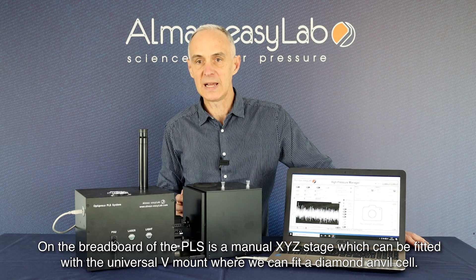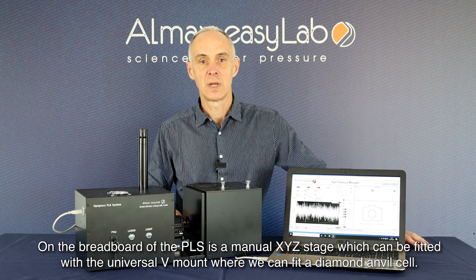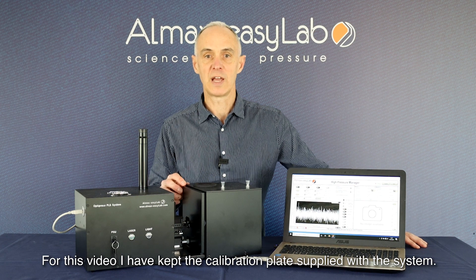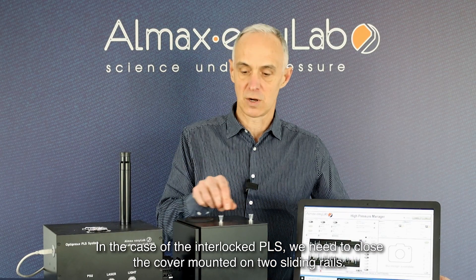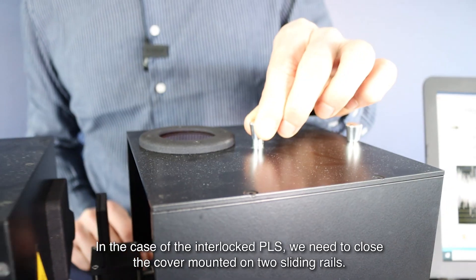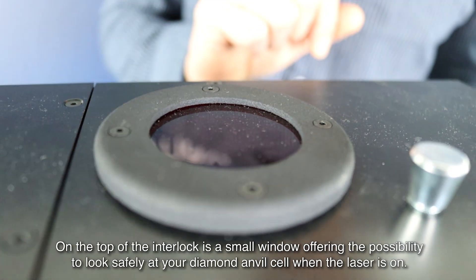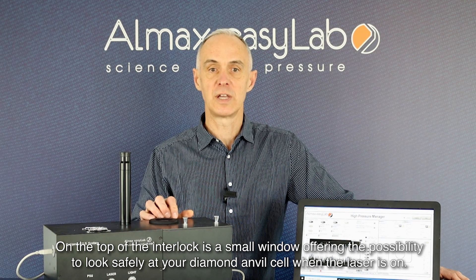On the breadboard of the PLS is a manual XYZ stage, which can be fitted with the universal V mount where we can fit the diamond anvil cell. For this video, I have kept the calibration plate supplied with the system. In the case of the interlocked PLS, we need to close the cover mounted on two sliding rails. On the top of the interlock is a small window, offering the possibility to look safely at your diamond anvil cell whilst the laser is on.